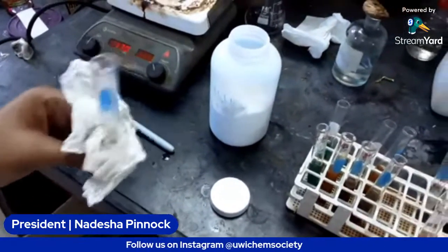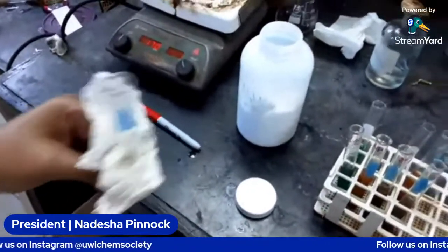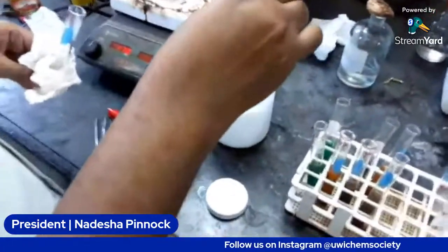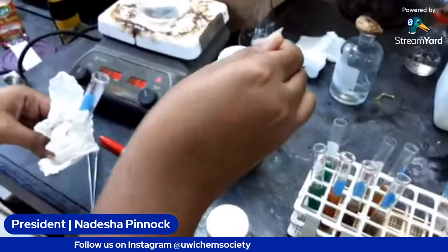We're just going to add it until it stops fizzing. And when it stops fizzing, then I guess it should be neutralized. And then we'll add a little more to make it slightly alkaline.